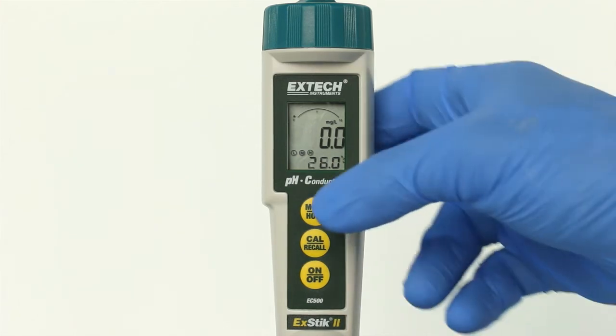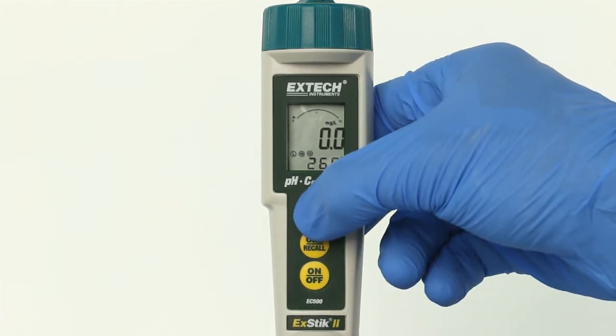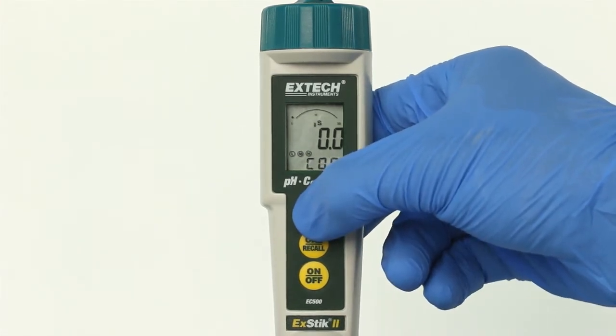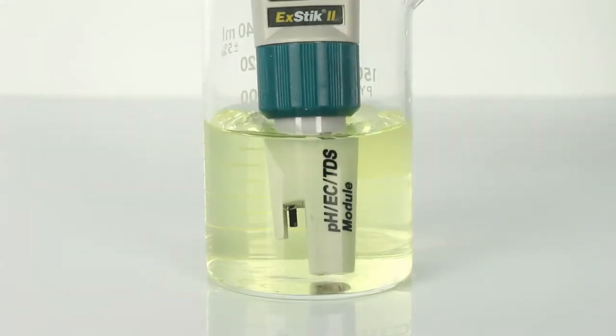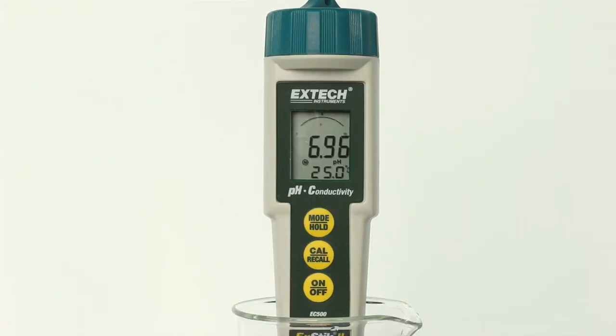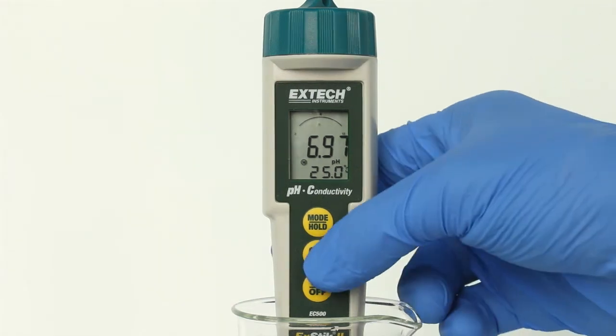Press and hold the MODE key to scroll to the desired measurement mode. Place the electrode into pH 7 buffer solution. Wait a few seconds until the temperature is stable.